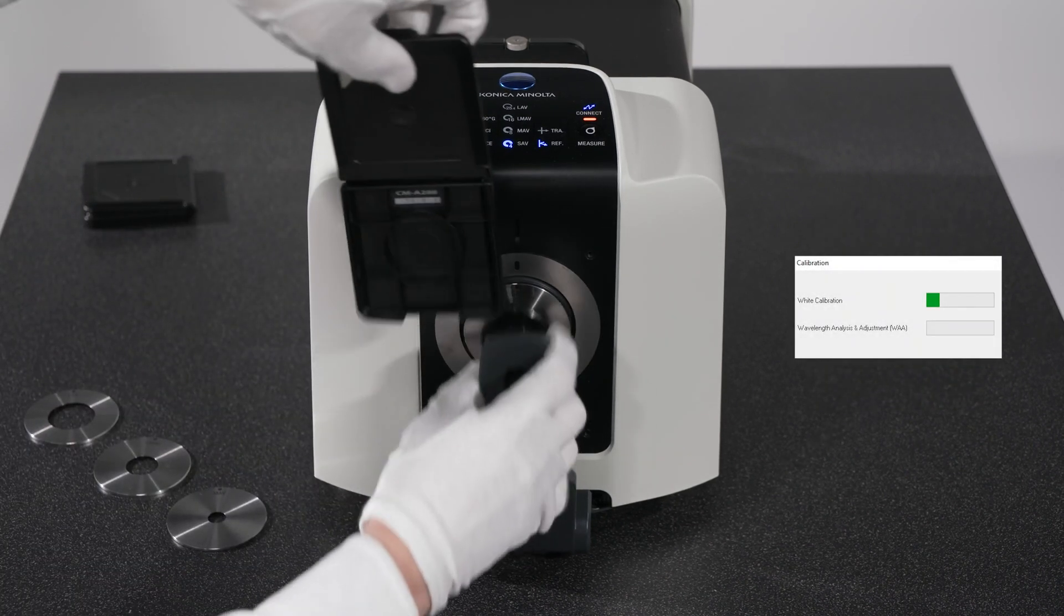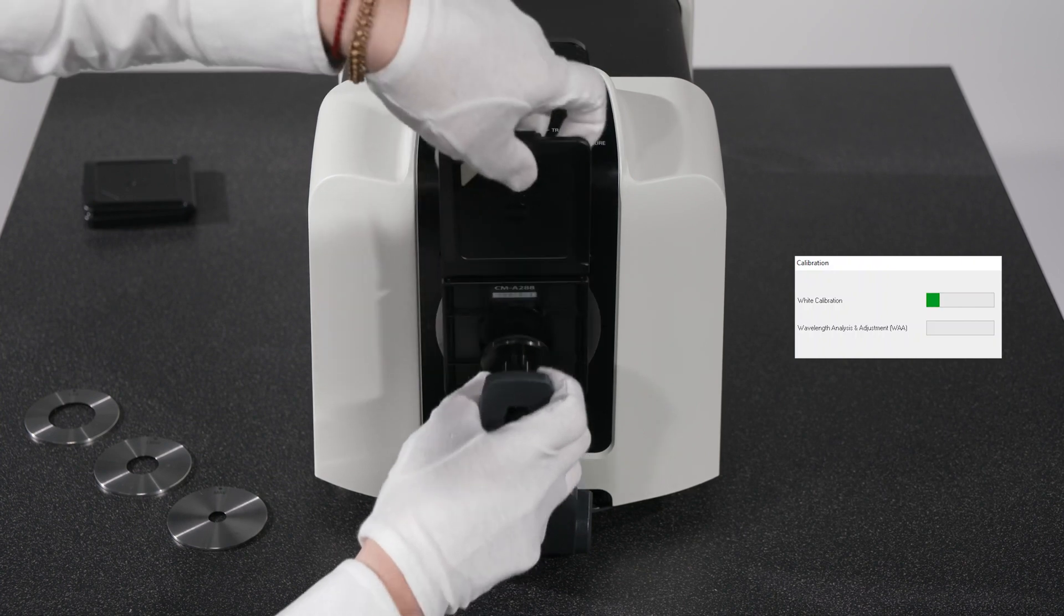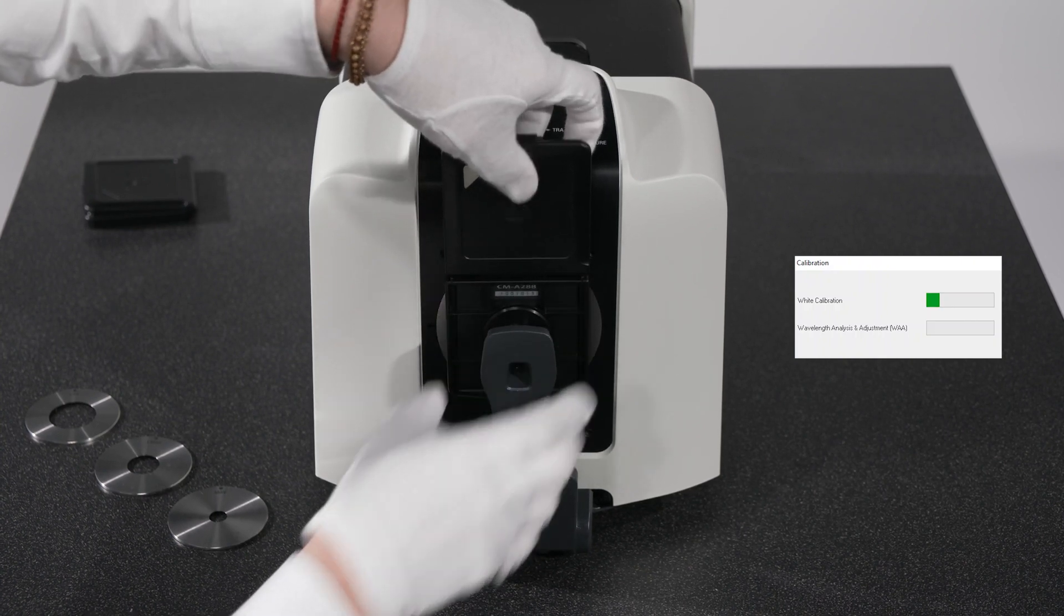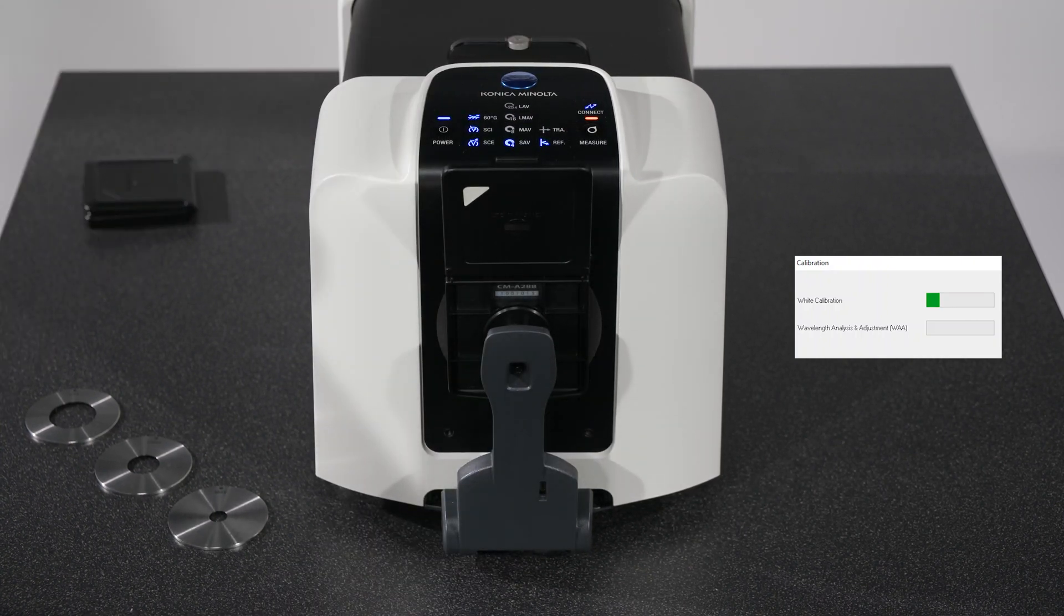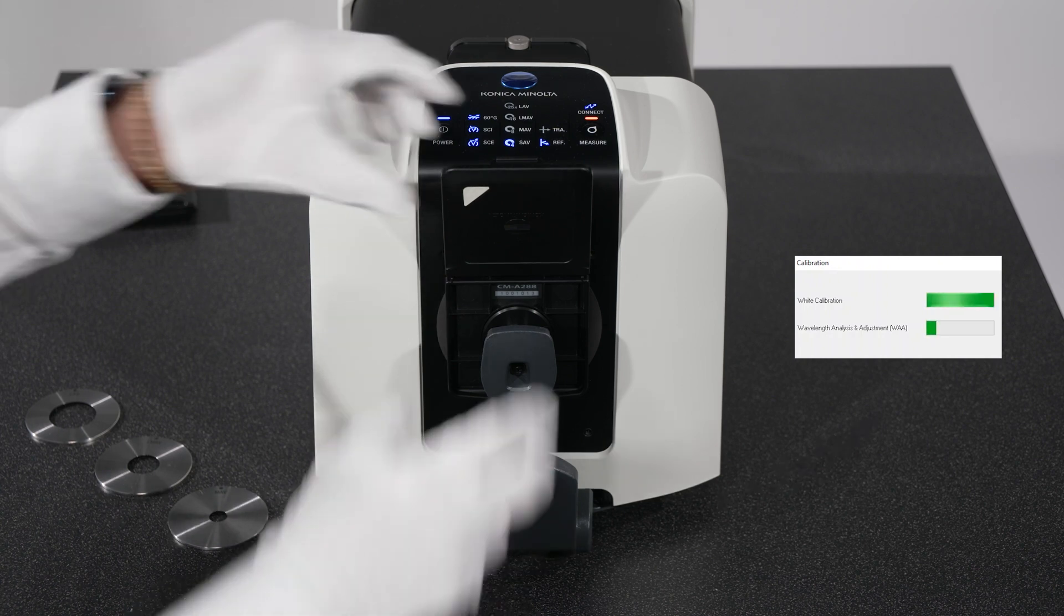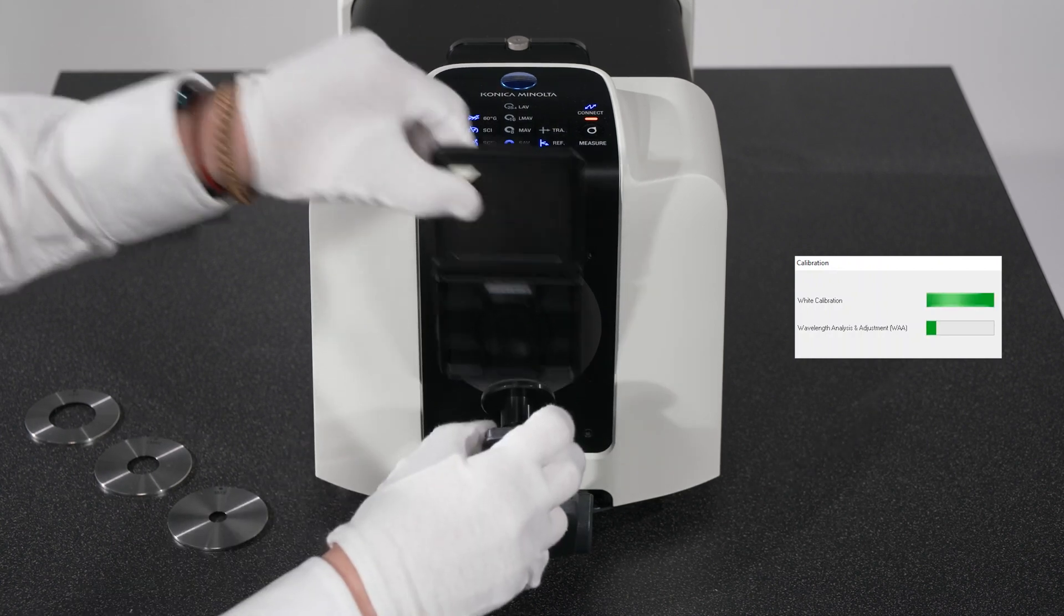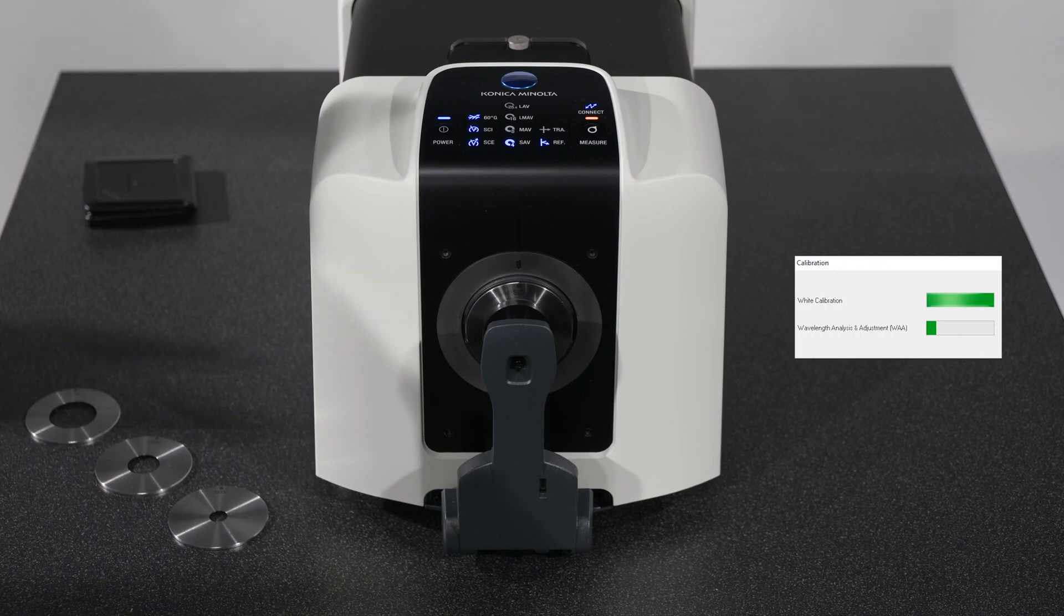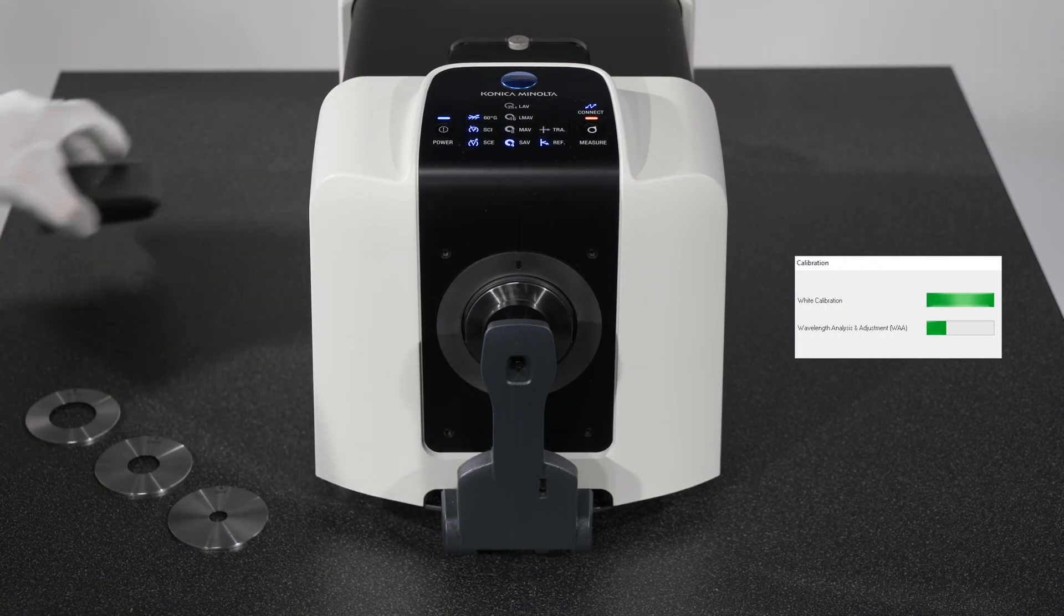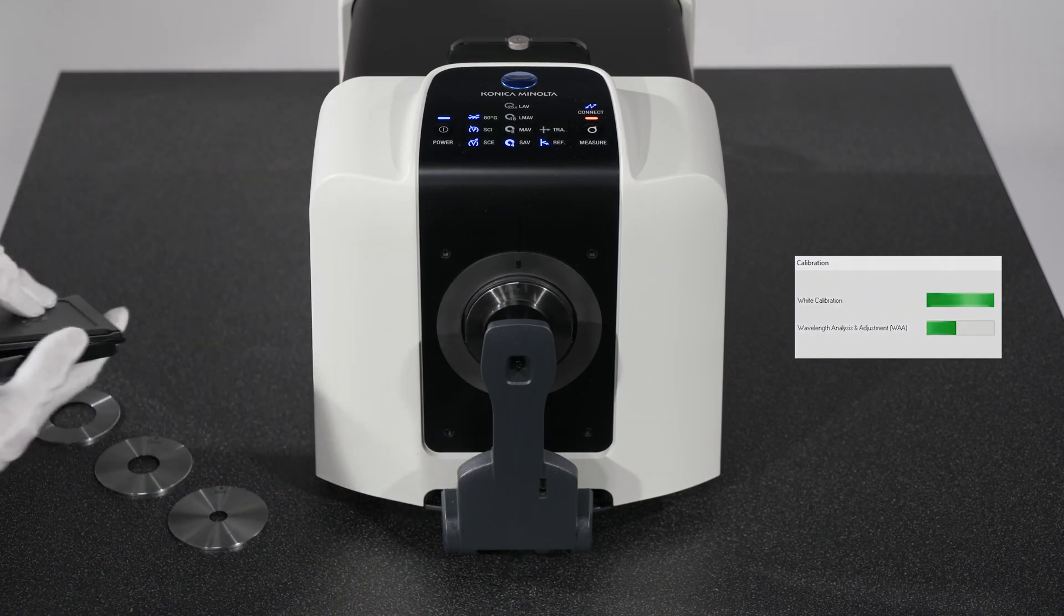Note, if the optional Wavelength Analysis and Adjustment function is activated, there will also be an automatic WAA progress bar after the White Calibration is completed, showing that it is going through the Analysis and Adjustment procedure.